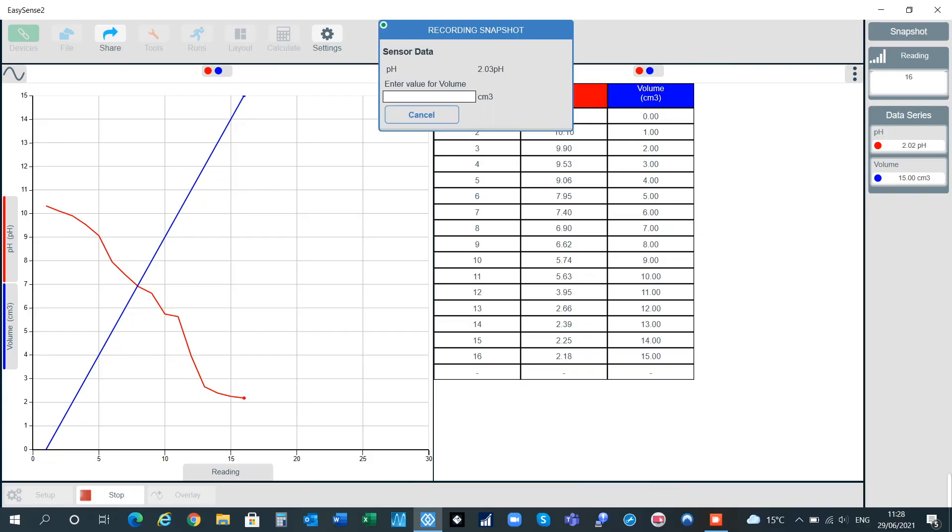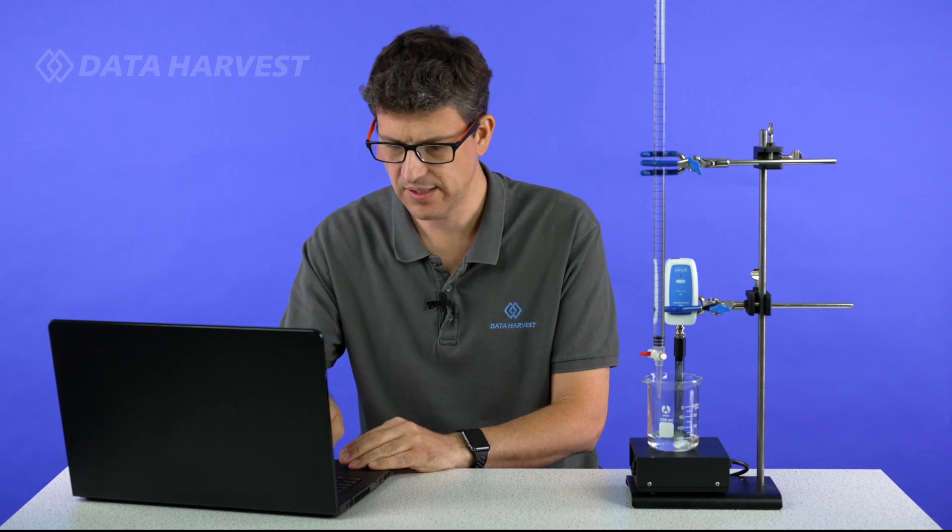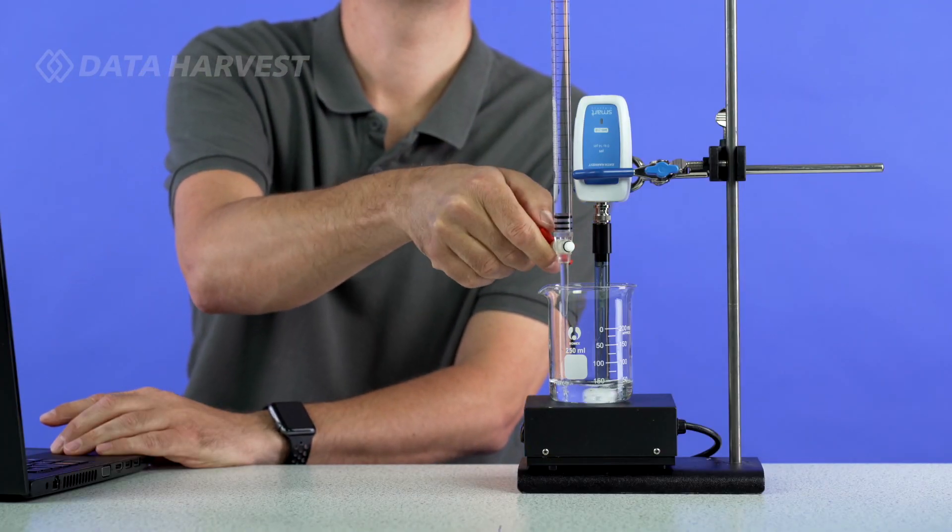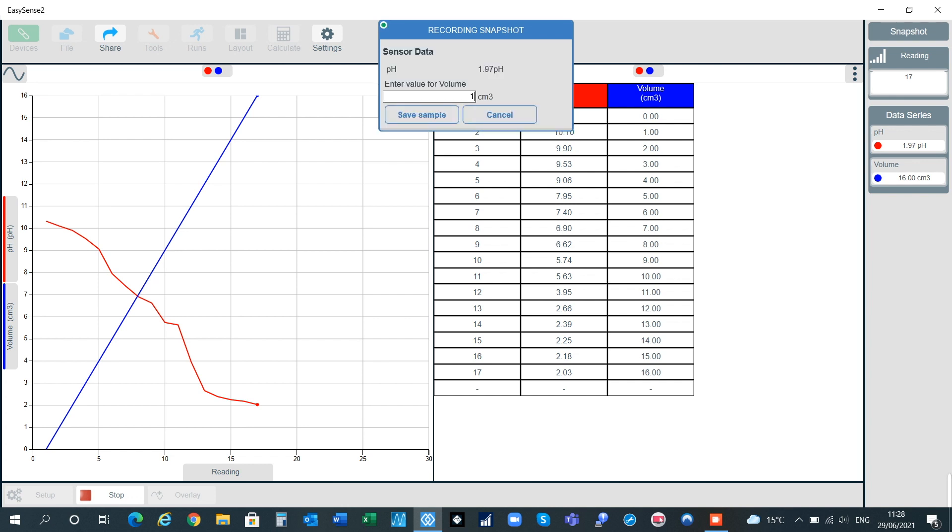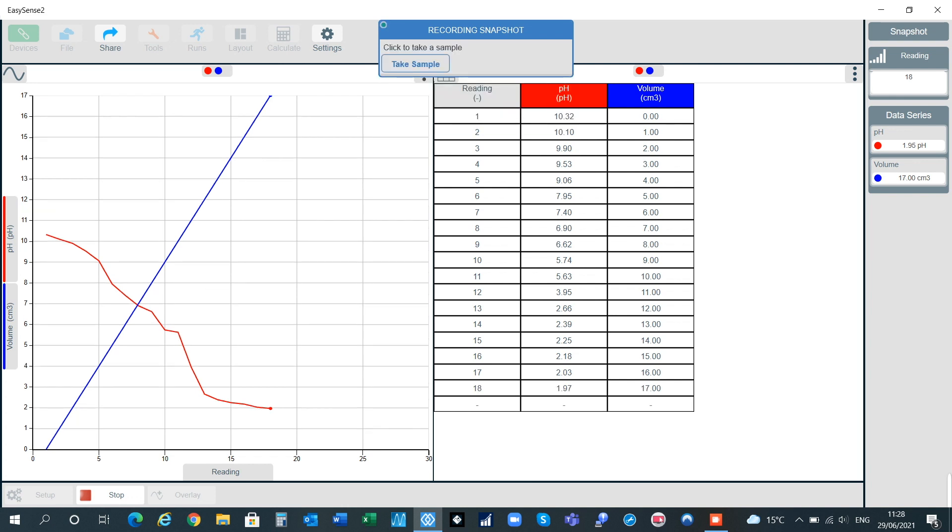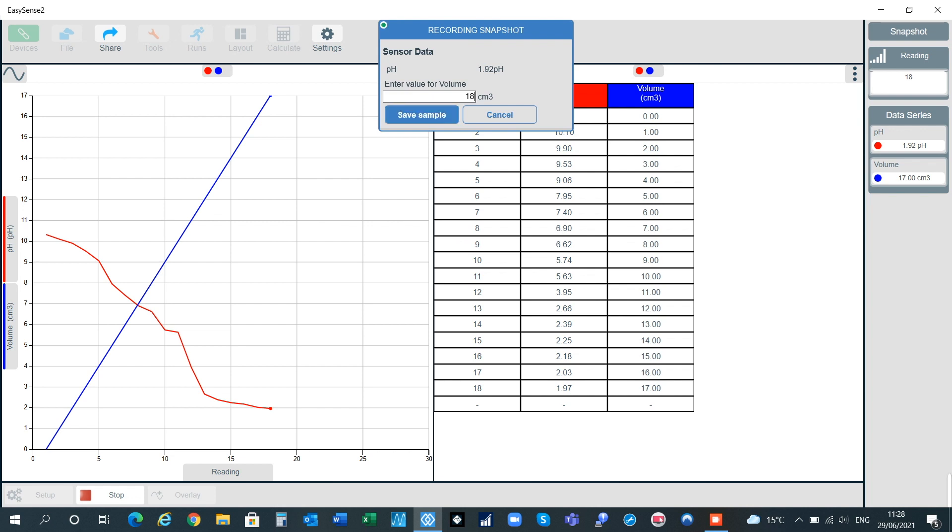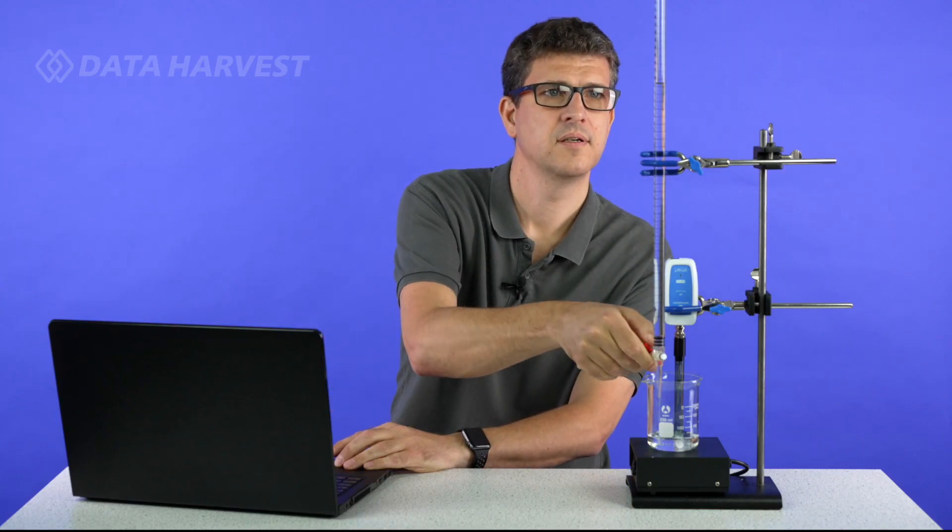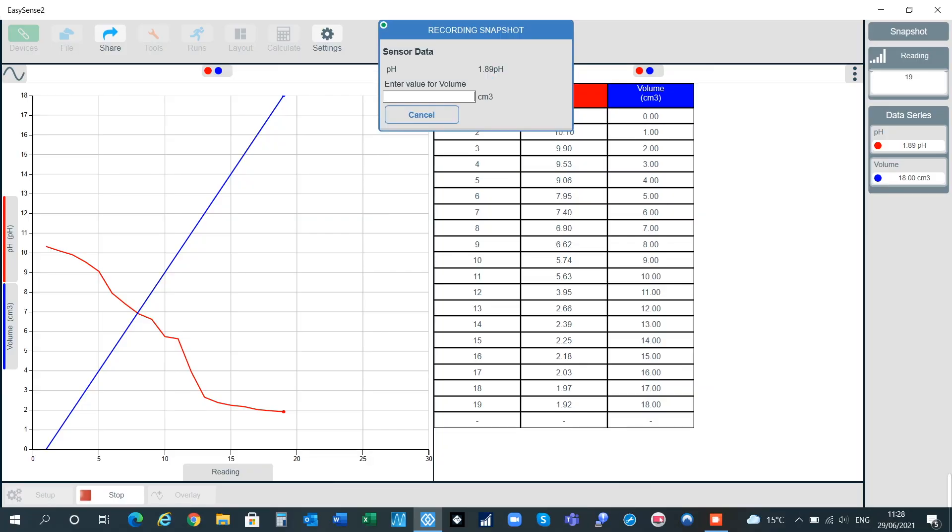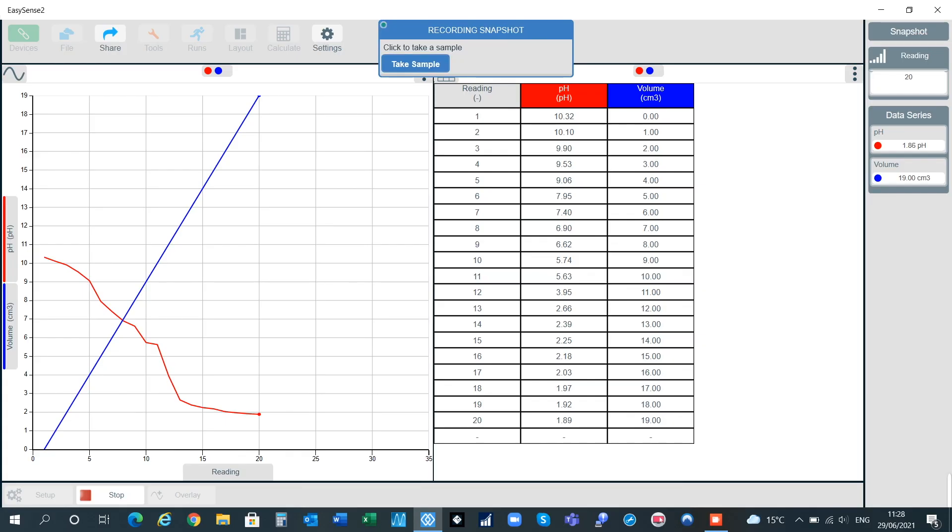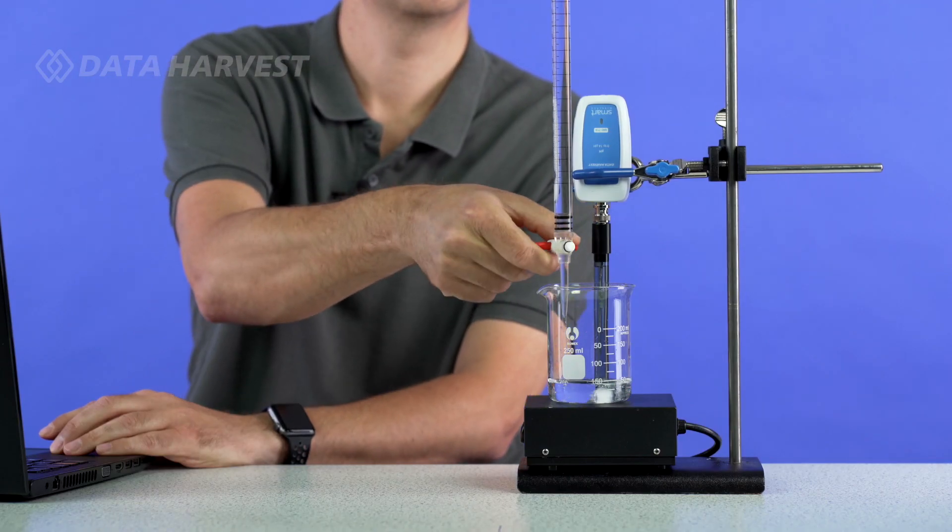Now you'd normally have two students doing this, one turning the tap. What was that one? 15. That was 16. So one turning the tap and one on the your phone, laptop, device, whatever you may be using. So up to 18 already. Oh there we go, a bit fast that time. And that was 18. Down to 20. 21.